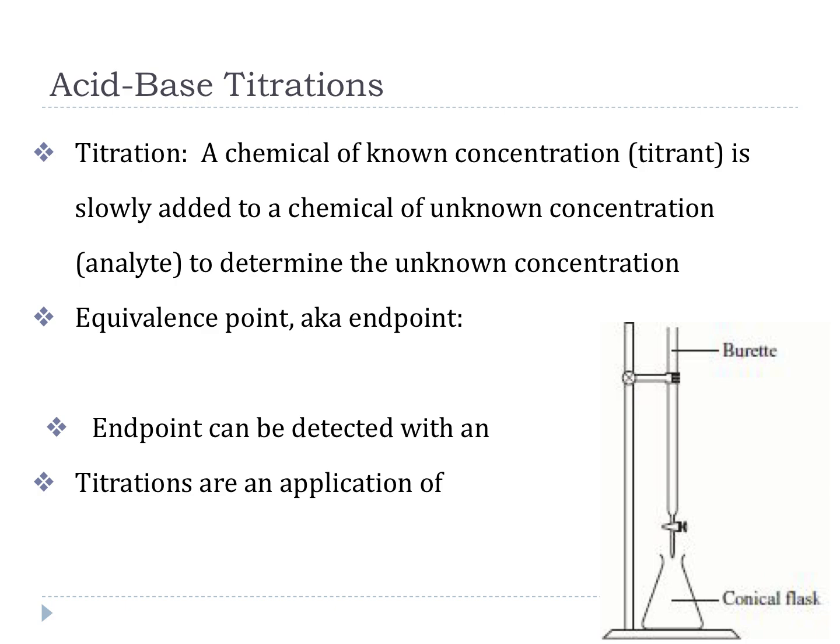You want to be familiar with some of the equipment that we use in a titration. So if you look over at the diagram to the side, you'll notice a burette. We have looked at those in class before, and we'll review what they are and how they work a little bit more later in the video. You'll see burette spelled B-U-R-E-T or B-U-R-E-T-T-E. I've seen both spellings. The burette is a tall, long, skinny chemical container that has a valve here on the bottom. That valve allows us to slowly dispense one chemical into another, and sometimes as slow as 1 or 2 drops at a time.